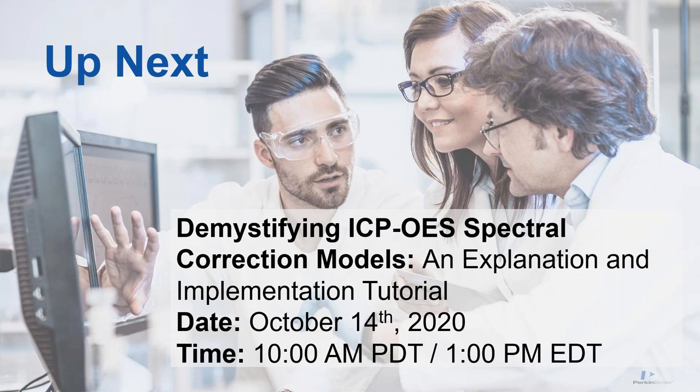Remember, in 2 weeks, we have a more detailed look into spectral correction models, both IEC and MSF, and get into the workflows for that.